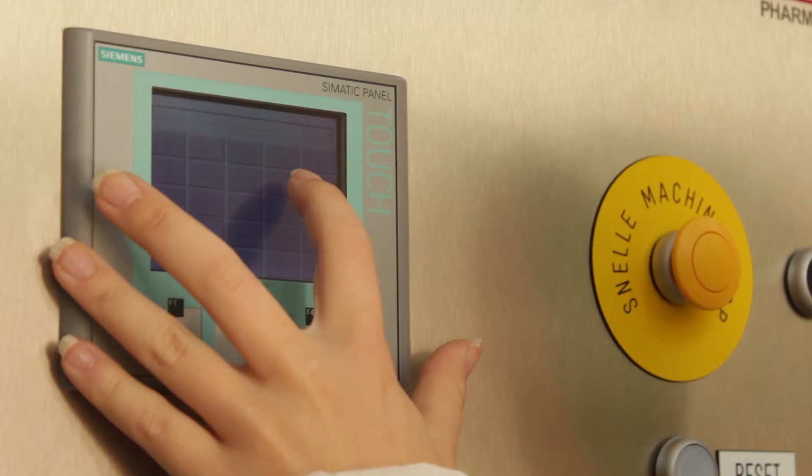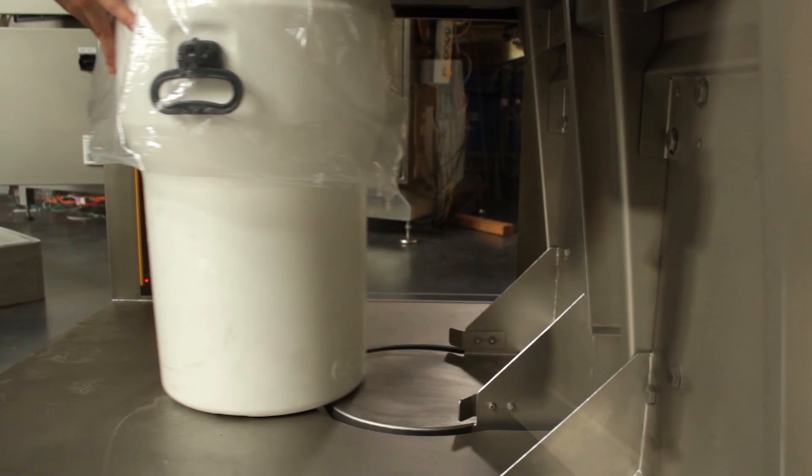A closed hopper with pneumatic valves can also be supplied by Technico Pharma.